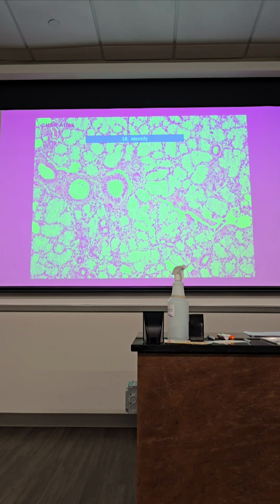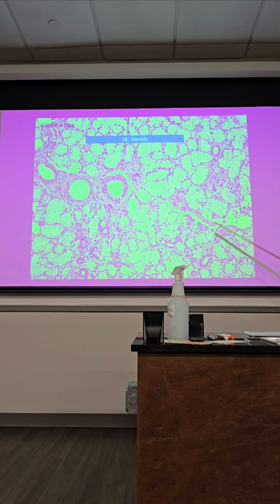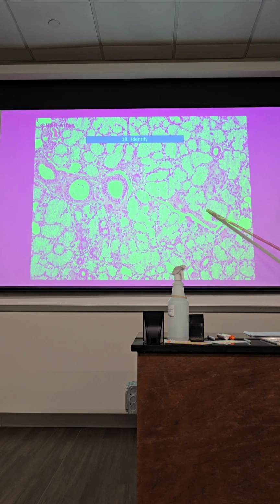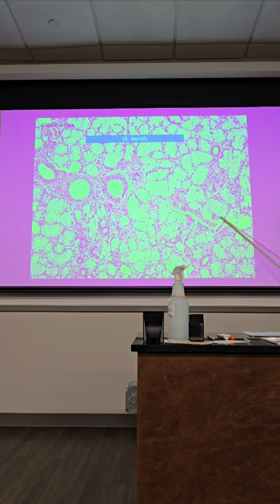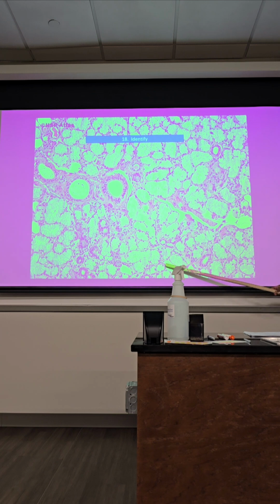Okay, it says identify the slide. Is that the sublingual? Sublingual, why? Because mucus acini predominates. All these white clouds you'll be seeing here, right? Now, what is this here? Mucus acini. The cells, this whole cloud here is mucus acini. If I just point to one, then it'll be the mucus acini cell, which I don't ask you anymore. I just want you to identify all of these as just mucus acini.